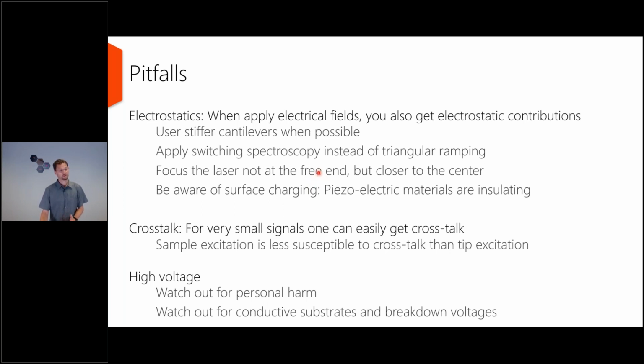If the laser is at a different position, you would see a smaller phase change between the two areas, between the oppositely polarized bands, and you would start to see an amplitude difference between the two bands.